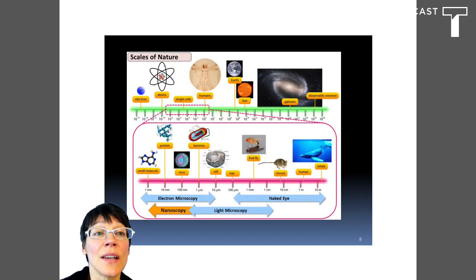So you're going to be using light microscopes in this lab, and light microscopes are useful for measuring cells. Cells are measurable in units called micrometers, and there are 1 million micrometers in a meter. And so you're going to need to get comfortable with that unit of measurement as you do this lab and as you proceed in your career in the sciences.